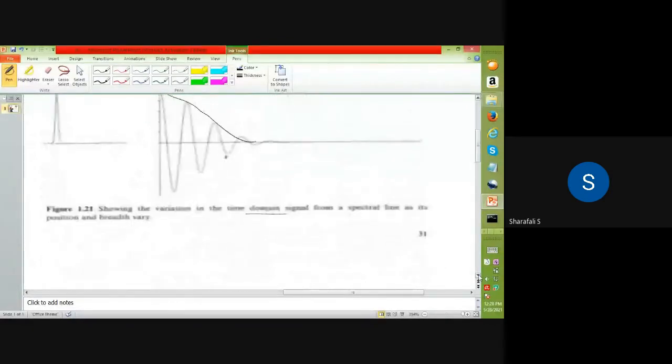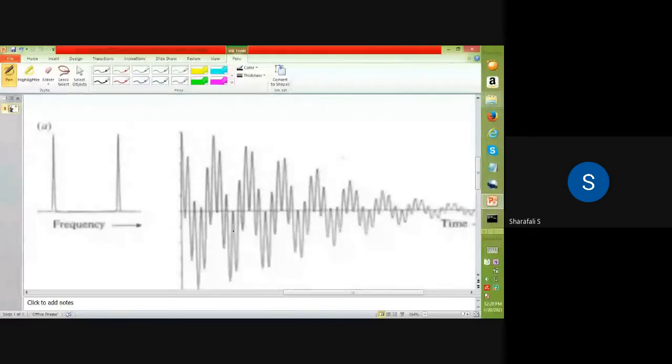And if you are using two different frequencies, what will happen? For example, with two different wavelengths, there are two things that will happen. When you have two frequencies, mu1 and mu2, they will interfere because they have a lambda difference and a phase difference.